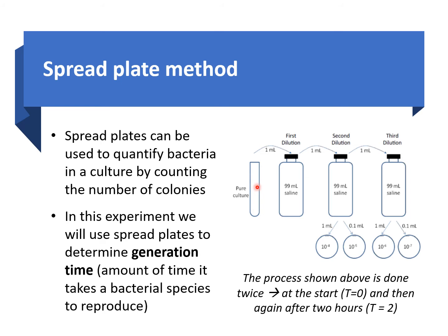But can you just look at it and estimate how many bacterial cells you have per milliliter in this broth? You can't. Therefore, to figure out the concentration, we dilute this sample, then we take some of the diluted sample and culture it on agar plates. After we do that, we count the number of colonies that we get on our plate, and based on that we can figure out the original concentration. I'm going to show you exactly how to do that, but this is just a quick overview of what we usually do.